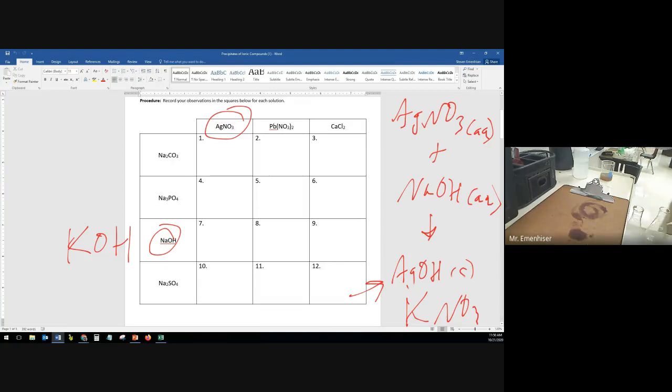So let's pour this one out. This is the bottle from yesterday. And so let's pour that here. Slowly, ever so slowly.